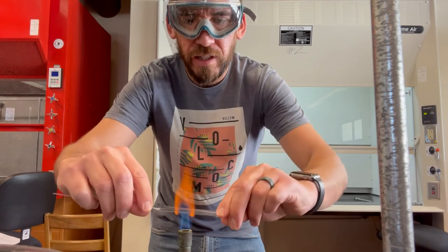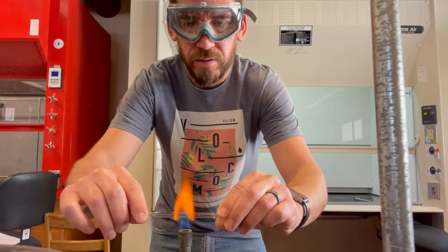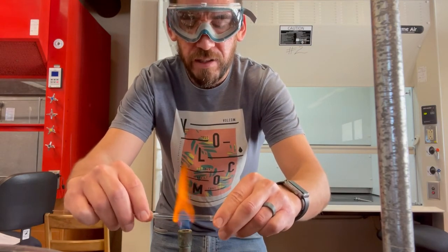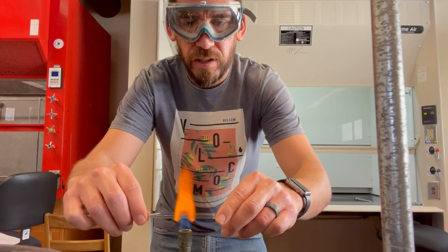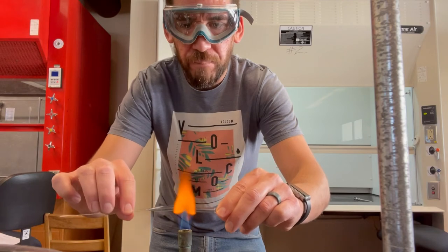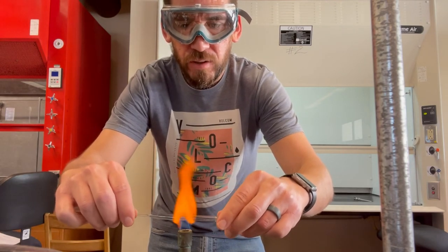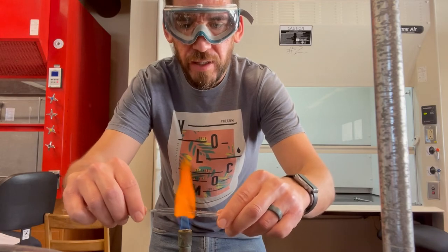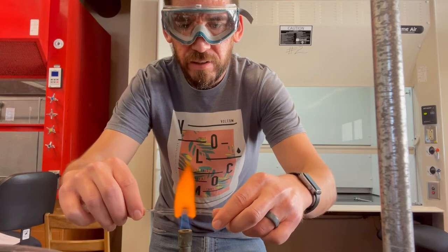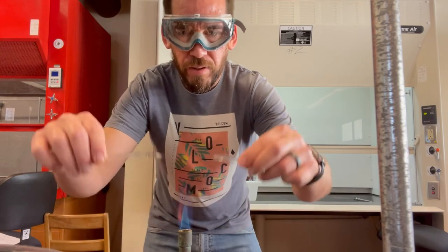Wait till you can, like right now I can't bend it, okay? I'm trying. Obviously you don't want to break that part, but it should bend very easily when it starts to melt. And so when it starts to melt, see, look at that. Okay, now I can still keep spinning because it's not quite melted enough. And then when it's getting a little easier, still spinning, still spinning. And then I'm gonna start pulling it apart and then lift up.